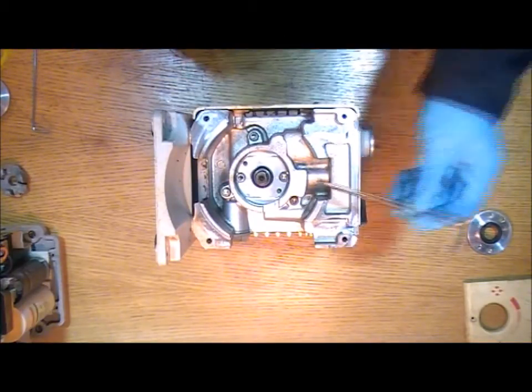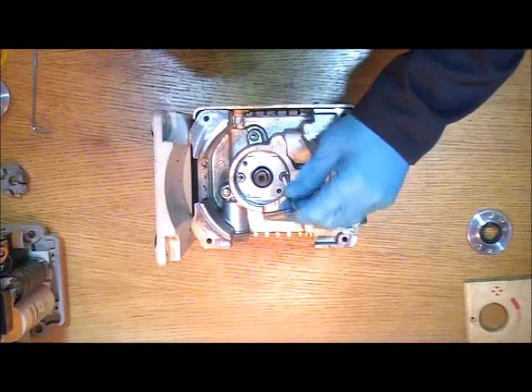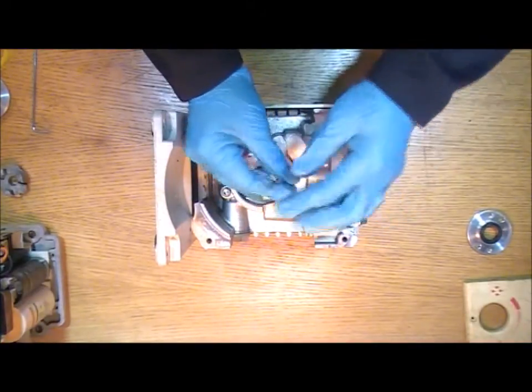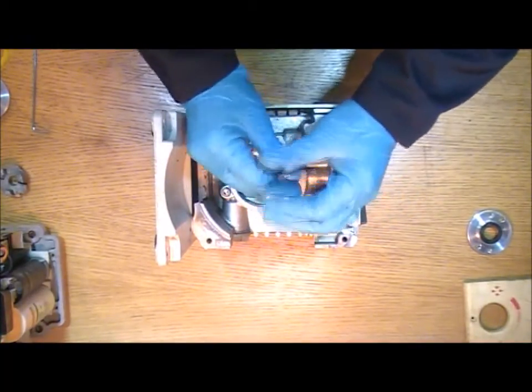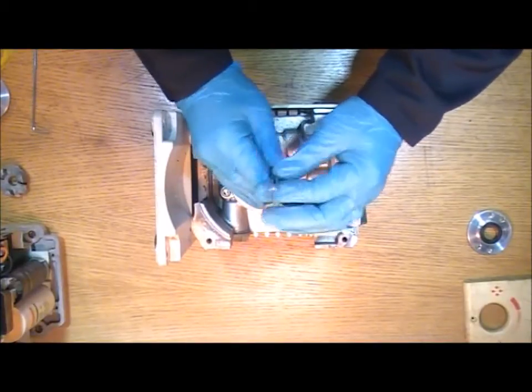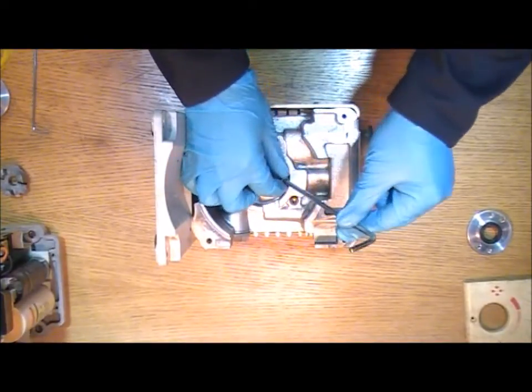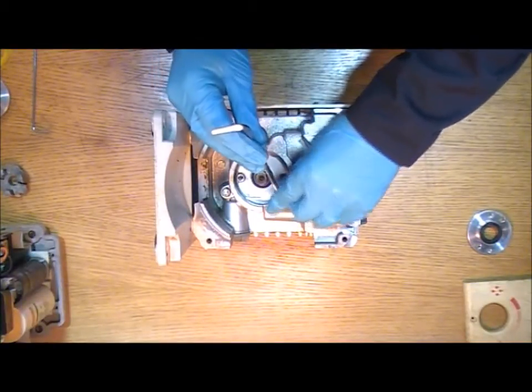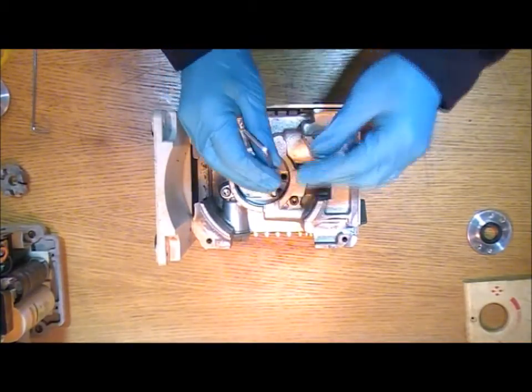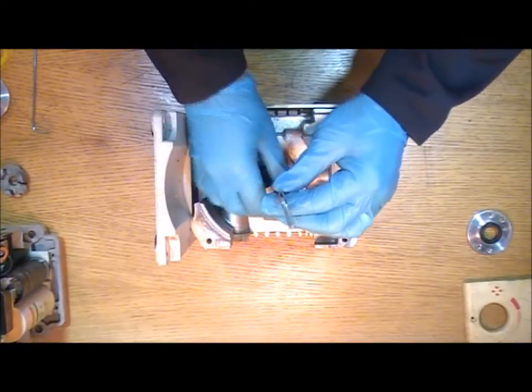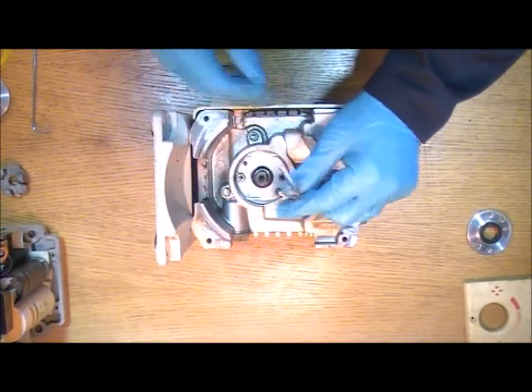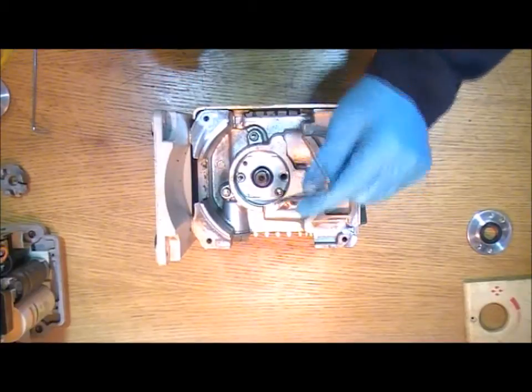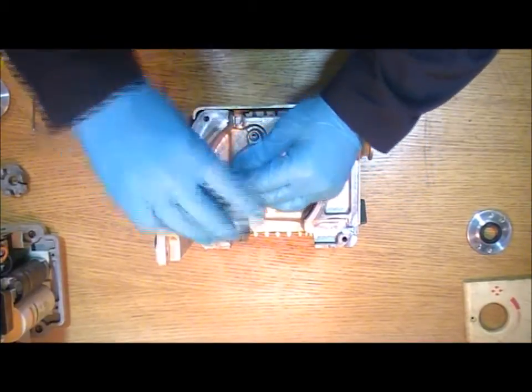So to remove the old seal you need to undo the two allen bolts that are here with your 5mm key. And as they come out if you move them directly to the adjacent hole which is threaded, just drive the bolt in so it's secure but don't tighten it down. And then do the same with the other one.